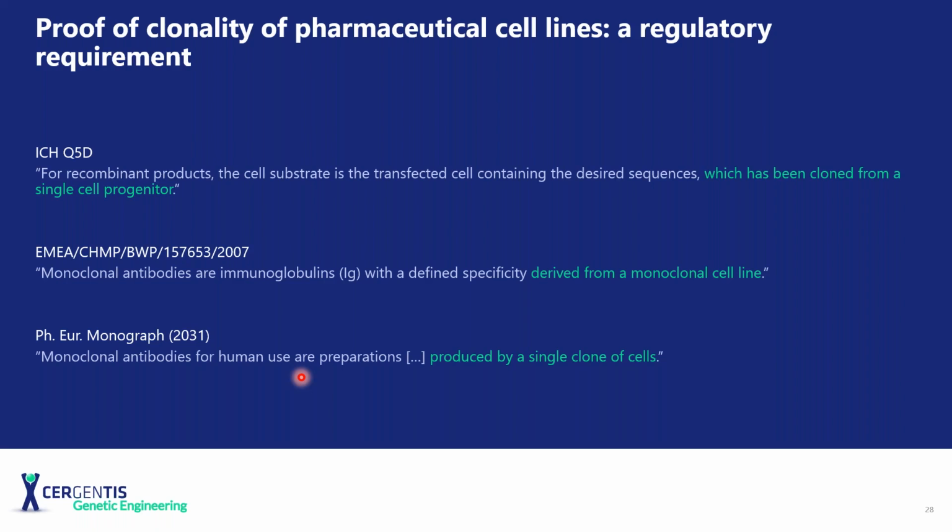A very well characterized cell line and cell line bank is fundamental to ensure the quality of the therapeutic products of the industry. So assurance of clonality is key to ensure consistency, quality, and the performance of the product during the life cycle. That's why it's mandatory. And the FDA has recommended to use 2 rounds of limiting dilution at sufficiently low seeding densities to provide acceptable proof of monoclonality.